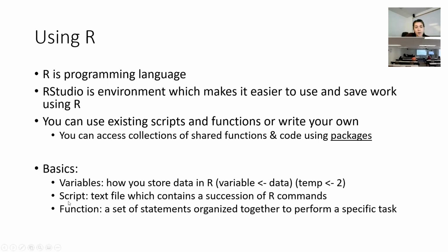So scripts are just a text file that contains a successive list of different R commands. It's one way to organize all of the work that you do in R. And you can use functions within a script. You can use variables within a script.